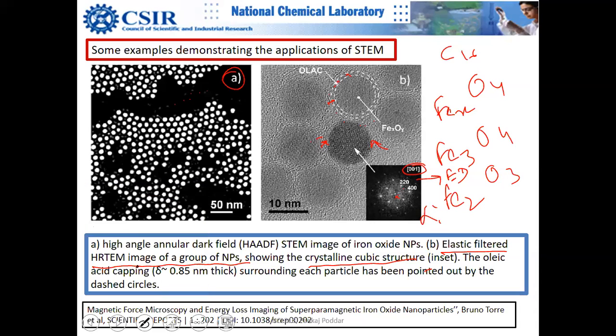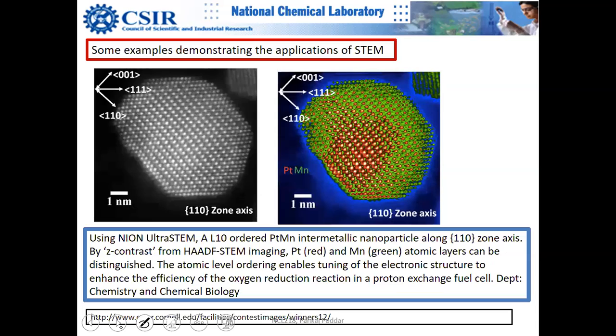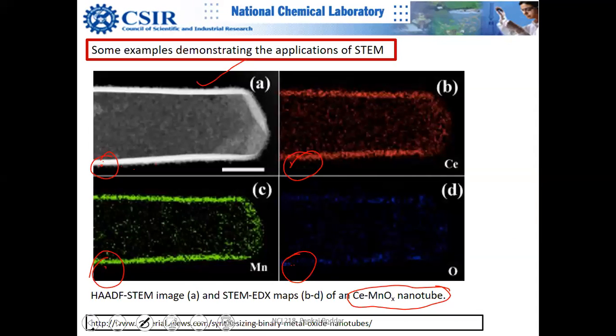You should understand this image. If not, it will be clear to you in the future also. Don't worry too much if you do not understand at this point. I only request that you look at the notes again and listen to this video again, because you have that luxury now. Earlier, this luxury was not there. So these are all taken from STEM. This is possible because of the power of STEM. STEM is actually a machine where you can do all kinds of analysis.